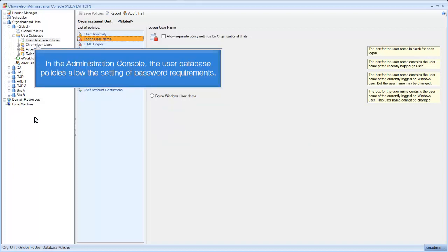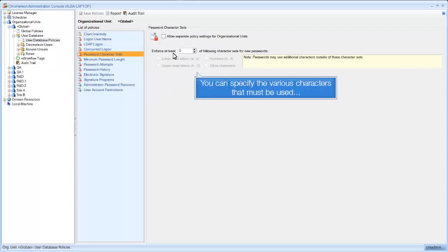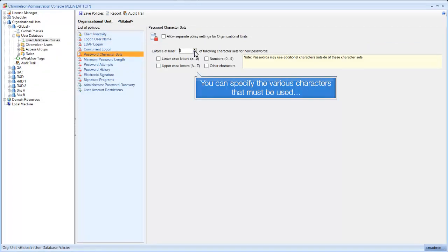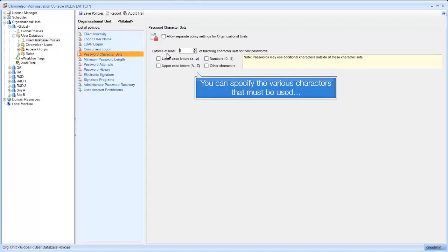In the Administration Console, the user database policies allow the setting of password requirements. You can specify the various characters that must be used.